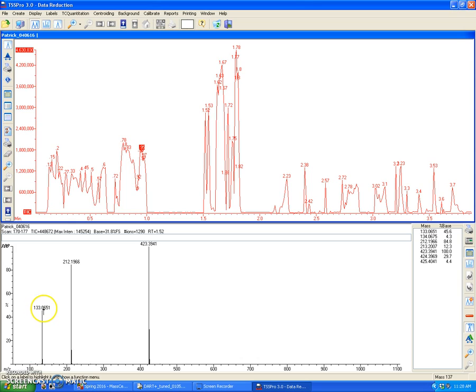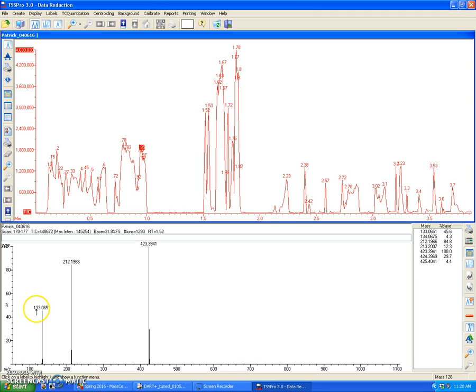This M over Z over here is 133.0651, which represents the mass spectral peak for cinnamaldehyde, for protonated cinnamaldehyde, for which the exact mass, or the expected mass of the ion, is 133.06534. And based off of my calibration, I get 133.0651, which is very, very good.